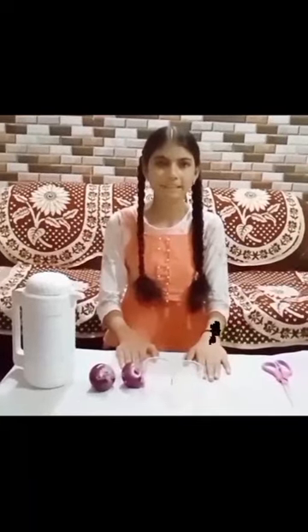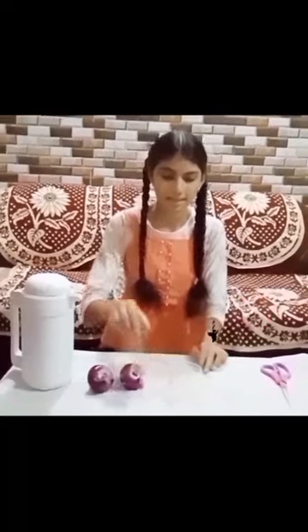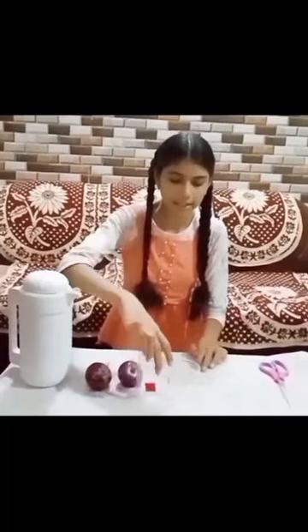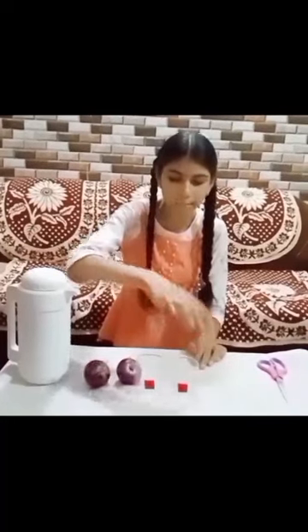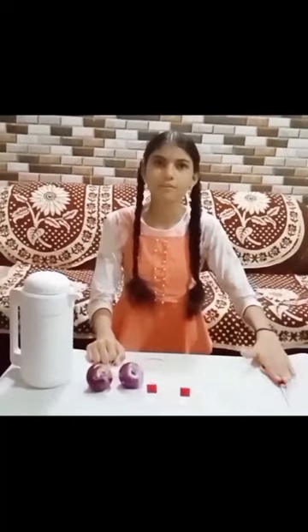For performing the activity we need two glass tumblers named as tumbler A and tumbler B. We also need two onions, as we study the tips of the onion, and we also need a pair of scissors.